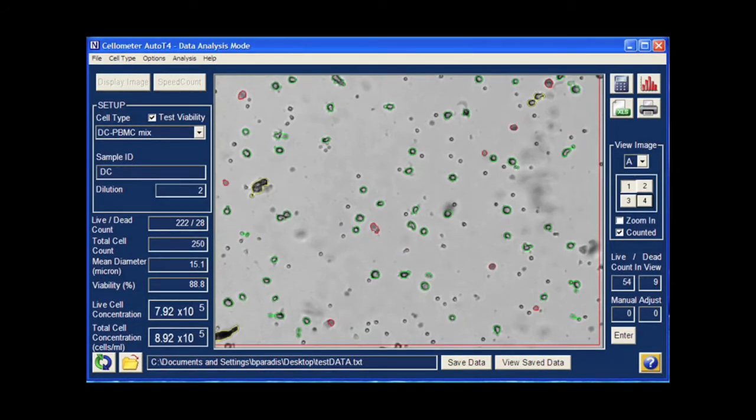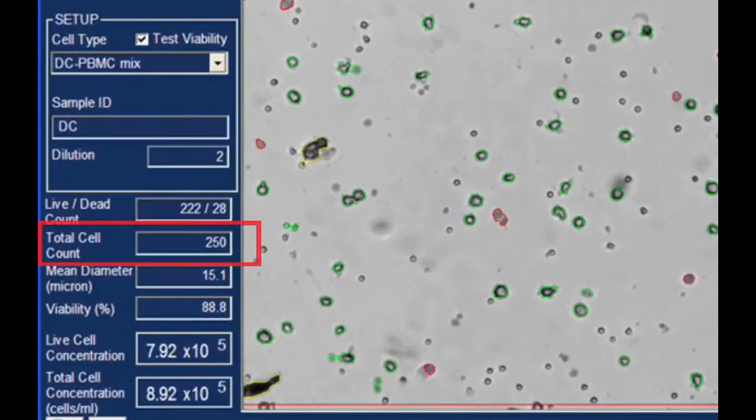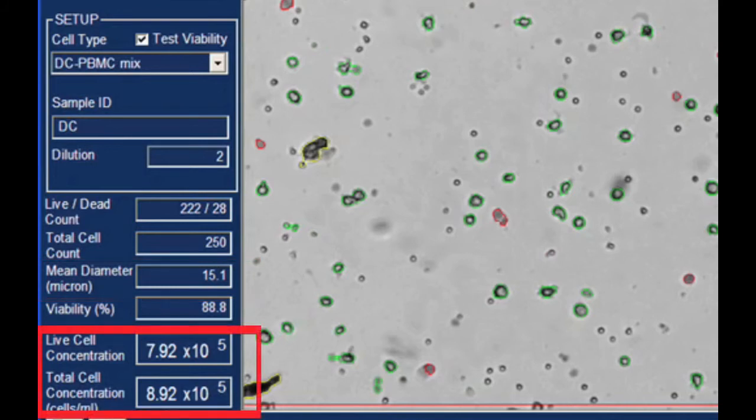When cell imaging and counting is complete, the initial results table displays total cells counted, mean cell diameter, concentration, and percent viability. Imaging and calculations are completed in less than 30 seconds for each sample.